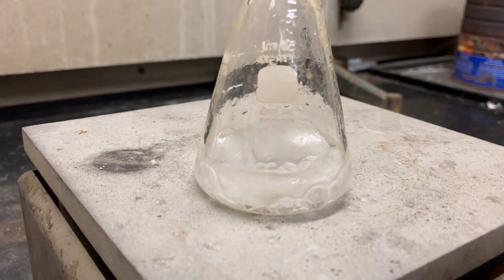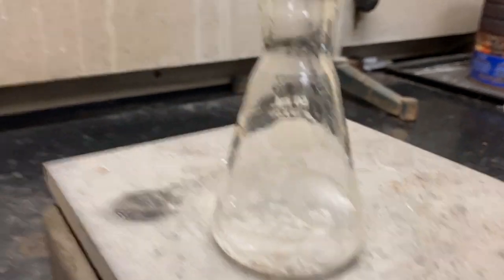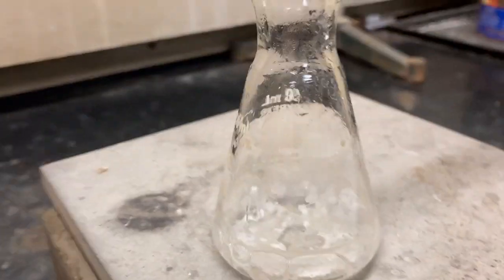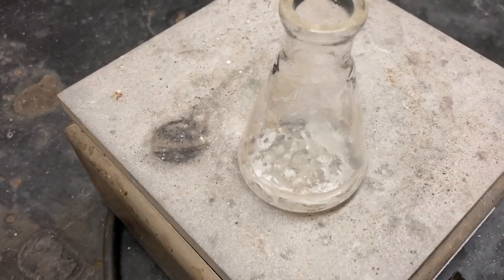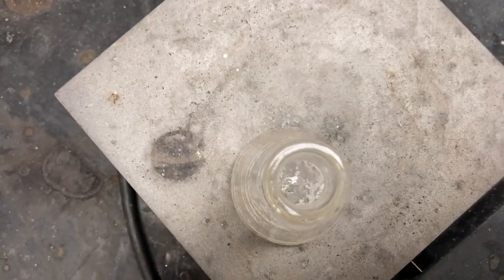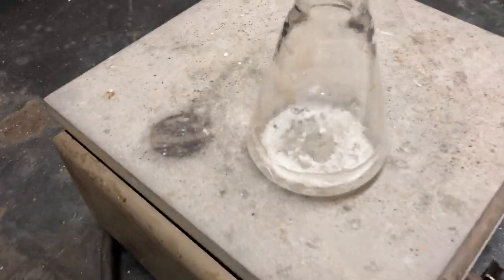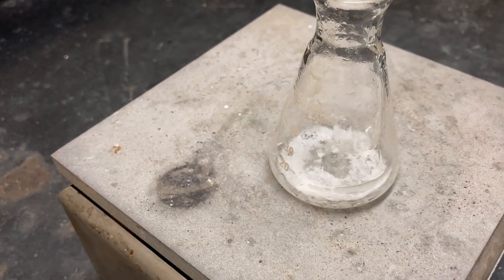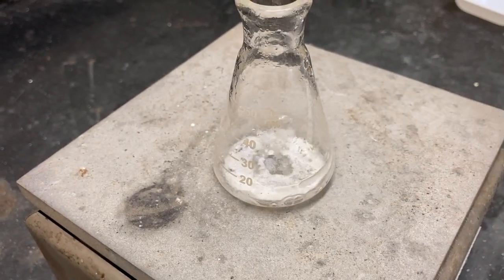Starting to see some solids. The bubbles are fewer and far between. Let's turn this down. Yeah, I see a white solid. Still some moisture left in there though, so we've got a little bit to go.